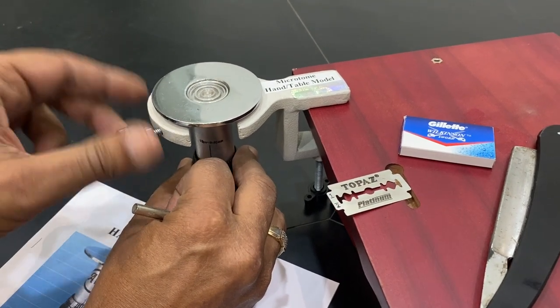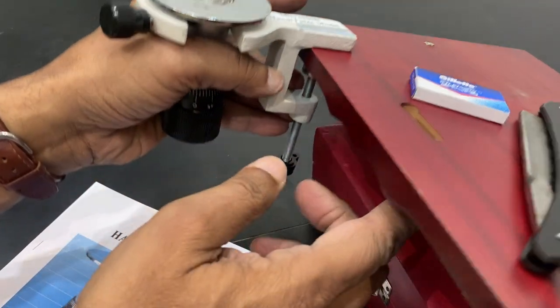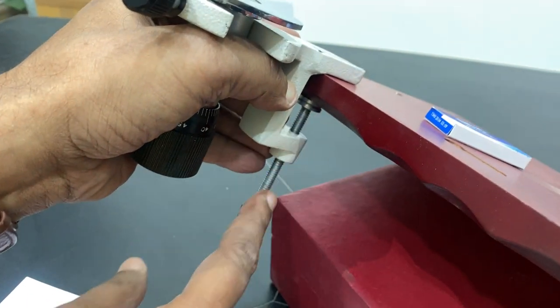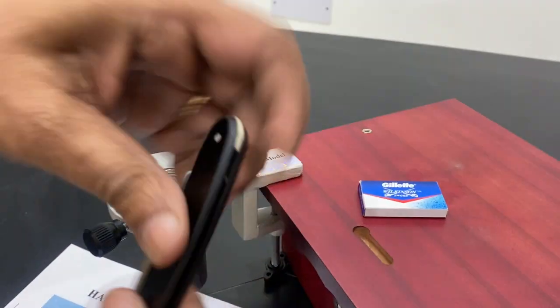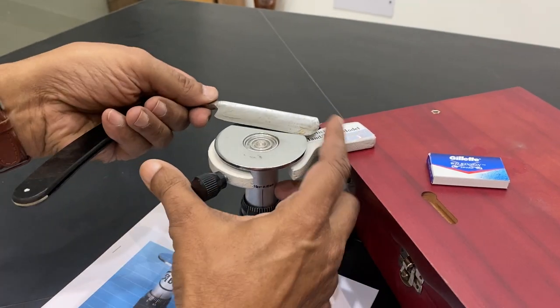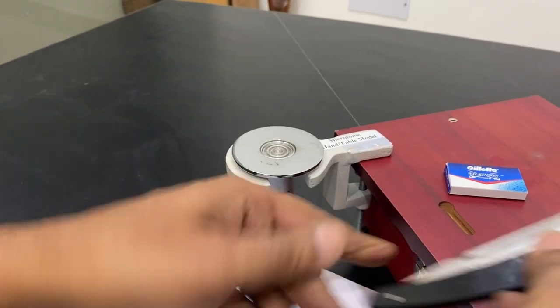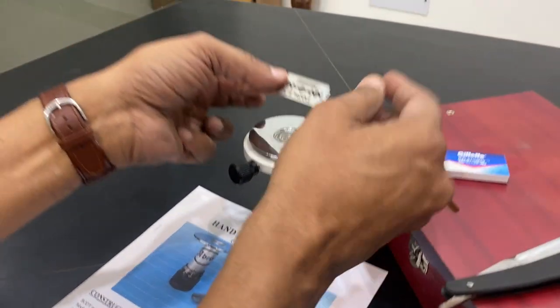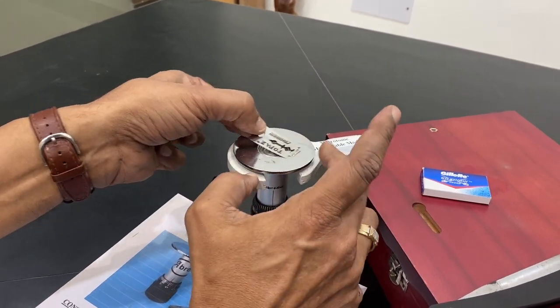You can hold it on the table — I have just kept it, see this table, the wax is there. To hold it on the table, I am just putting it, and then you can put a sample and cut using the blade like this, from left to the right. Or you can use a fresh blade and cut using a sideways movement like this.